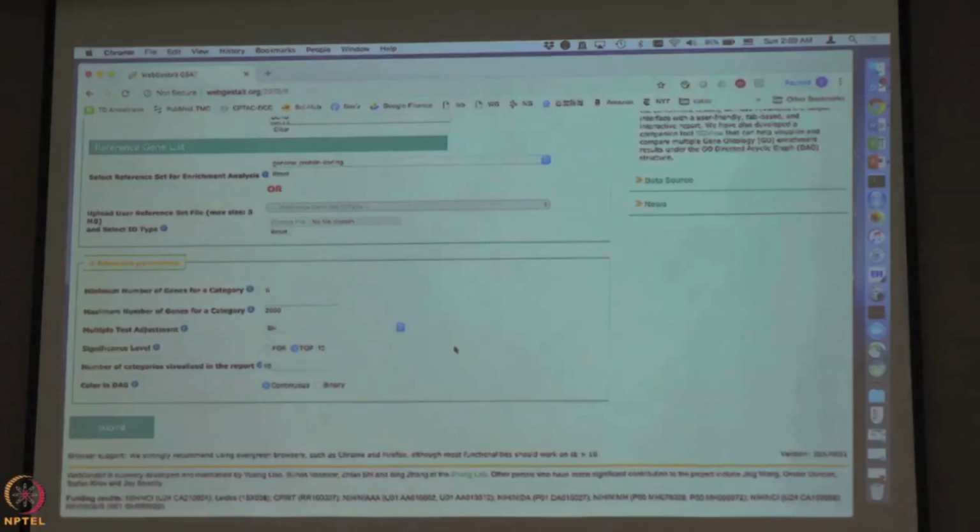And sometimes if your difference is really huge, you end up with thousands of enriched terms, and then you cannot comprehend all of those either. So doing the top 10 as the first step can give you a sense of how strong the signal is in your data set.